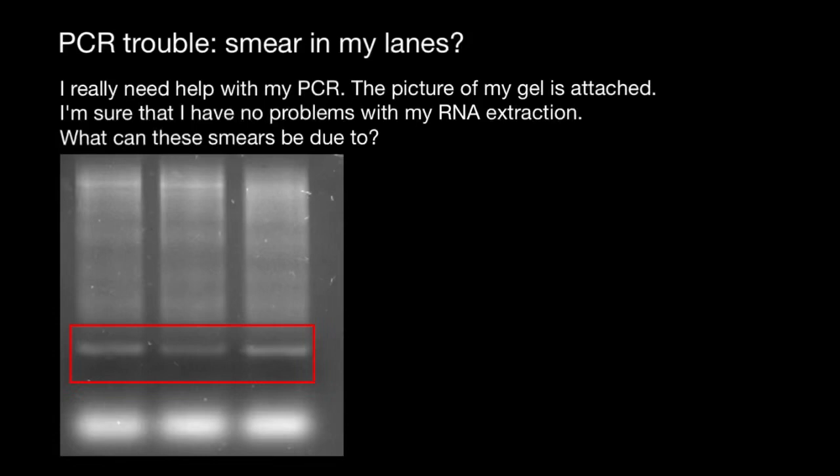Hello and welcome to Nikolai's Genetics Lessons. Today we are going to talk about another case study: gel electrophoresis troubleshooting, but it also can be PCR troubleshooting.